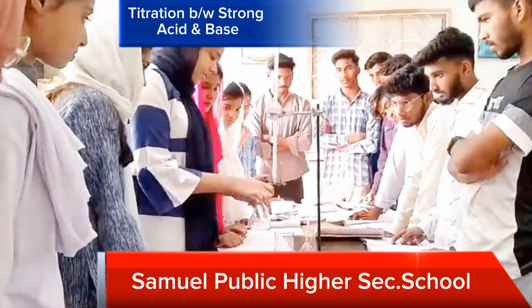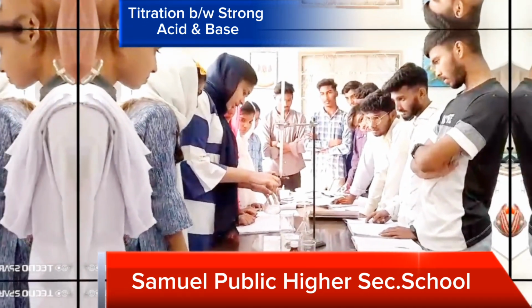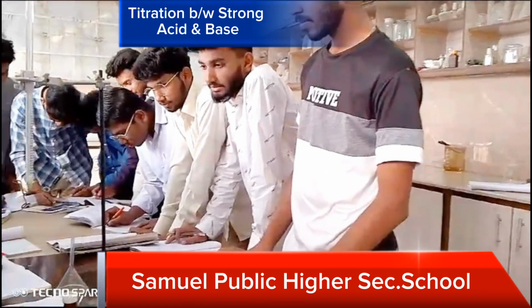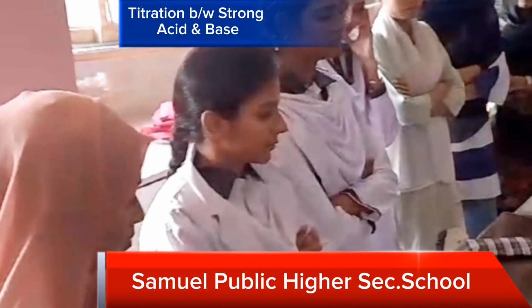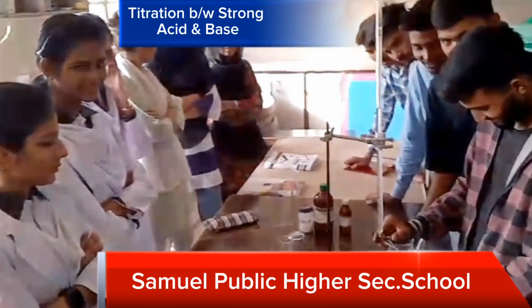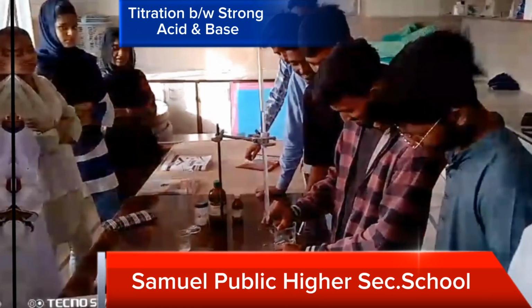After this procedure, we take 10 ml hydrochloric acid in a conical flask by the pipette, and then add the phenolphthalein indicator in the conical flask.